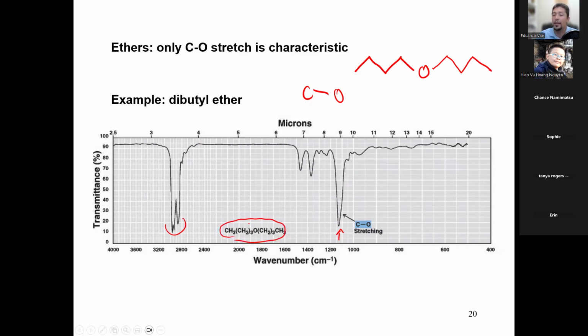So this might be something I might give you on the post-lab quiz. I'll give you this IR spectrum, I'll give you the structural formula, and I'll have you tell me which functional groups are here and point to them, right? And you have to be able to know. What if you get confused and you're like, well, maybe this one is and this one is, right? Well, sure, but look at the intensity. This one is at like 70 and this one is at like 60-ish, right?